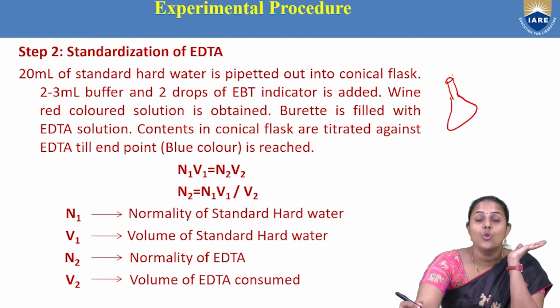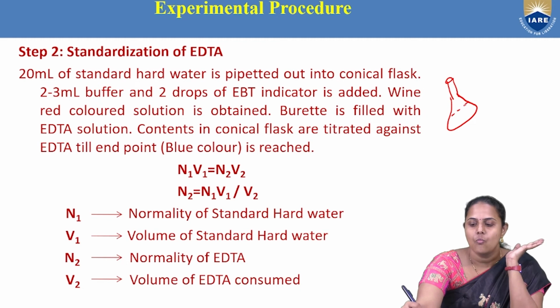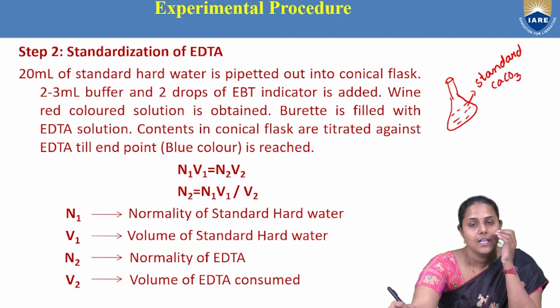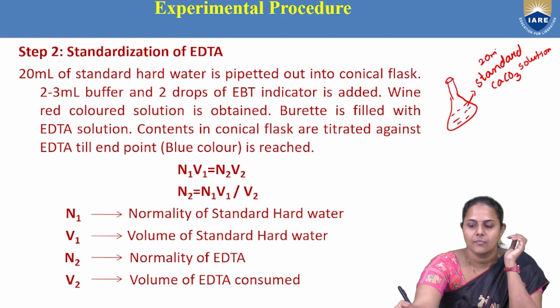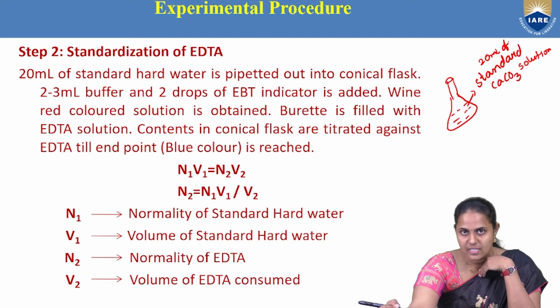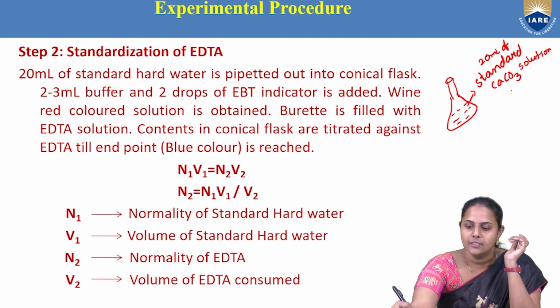This is a conical flask. In this, we will be taking standard calcium carbonate solution, that is 20 ml. 20 ml of the calcium carbonate solution which we just prepared, that one we will be taking.